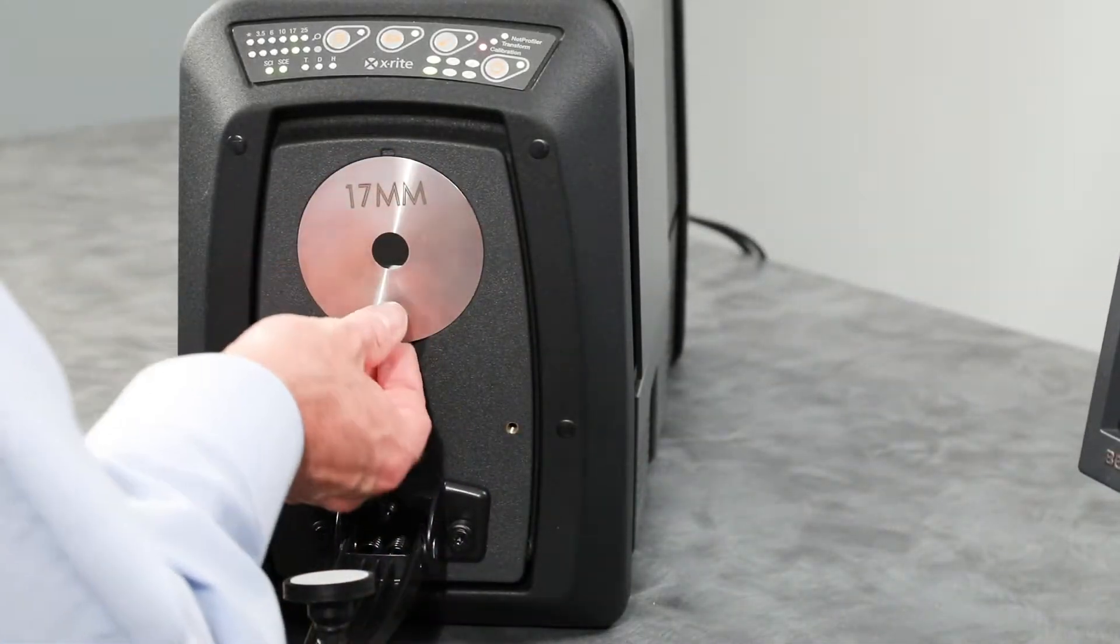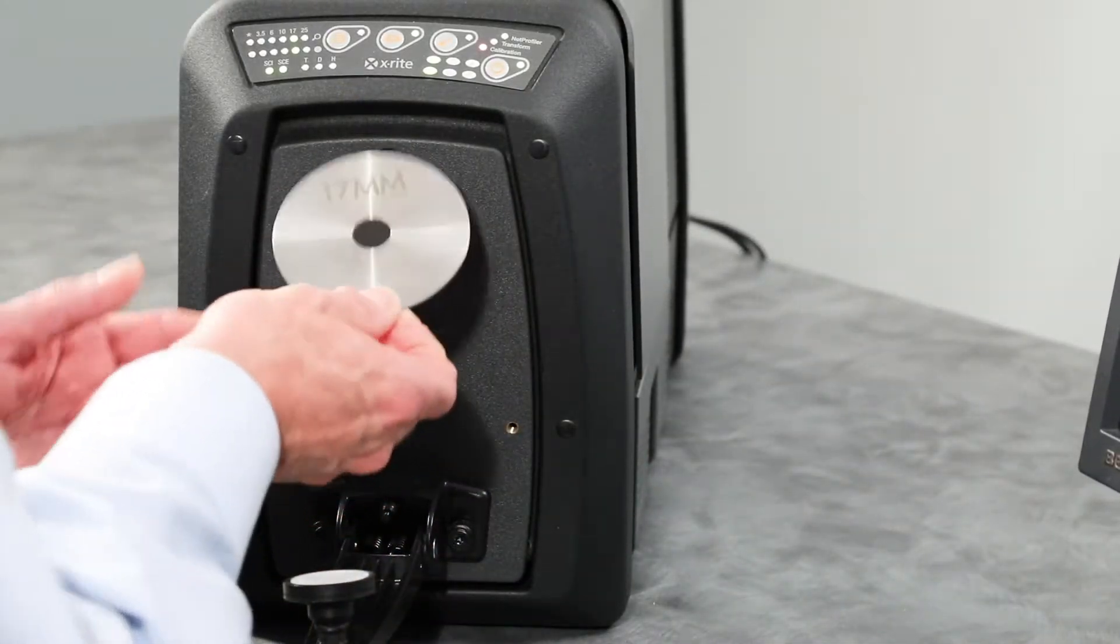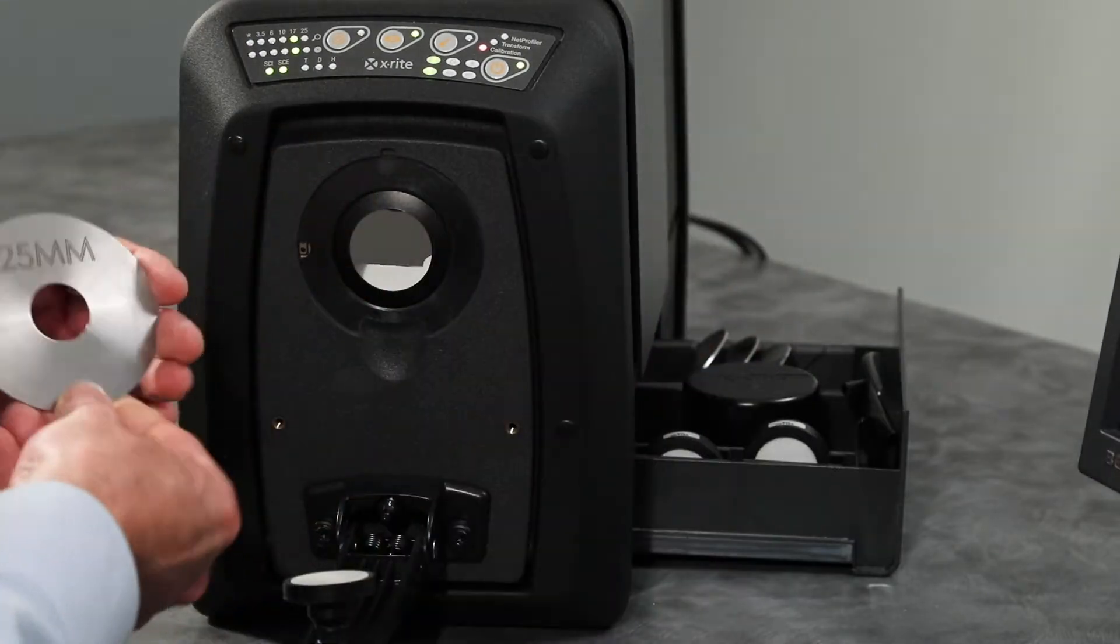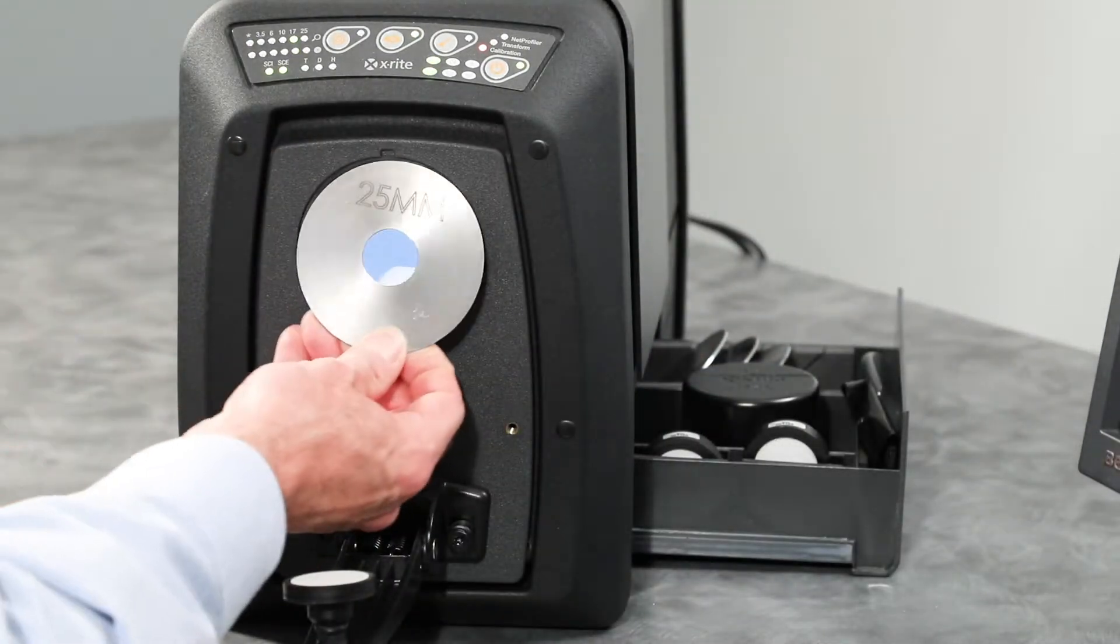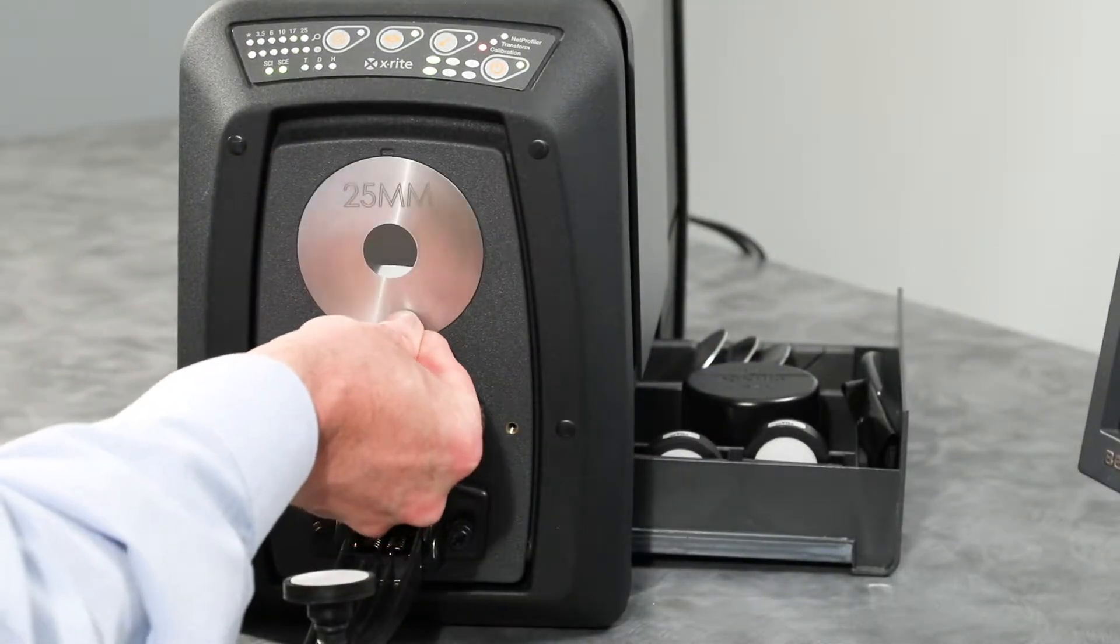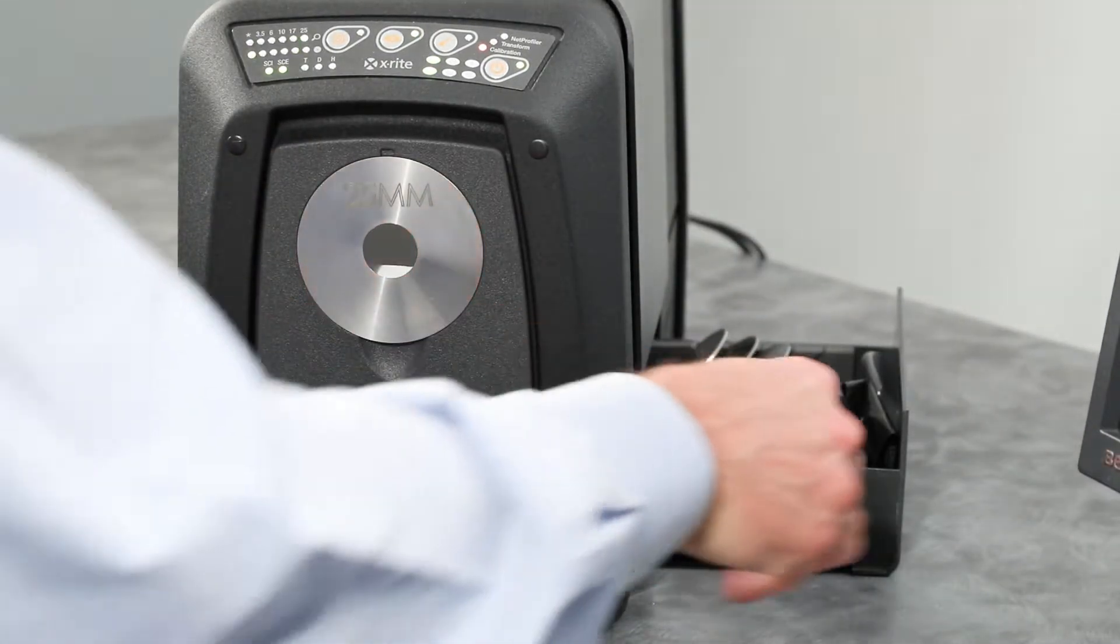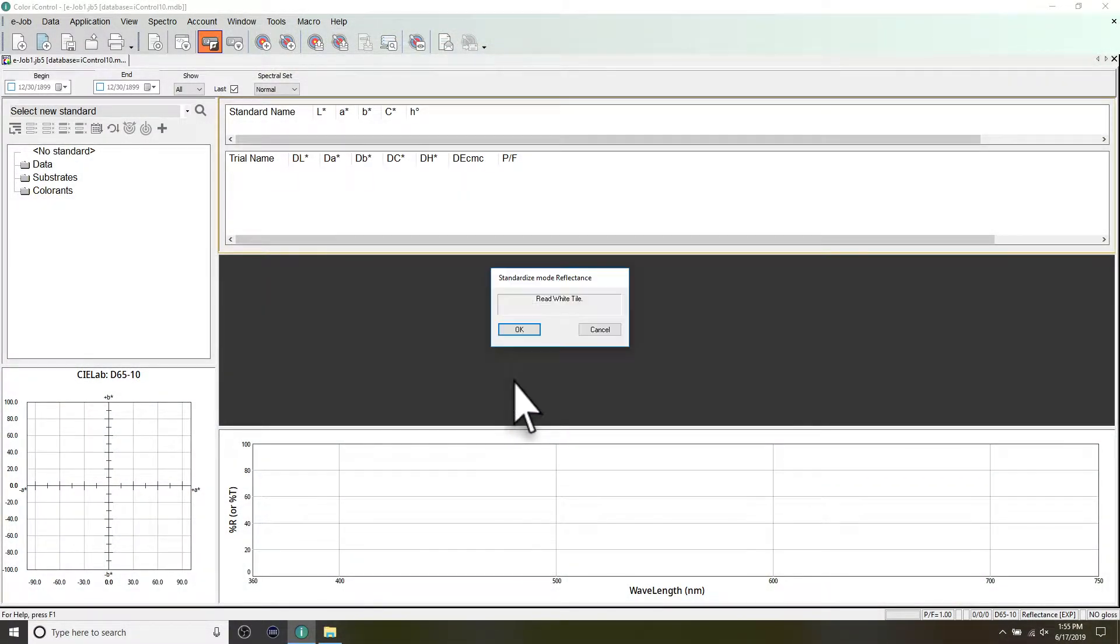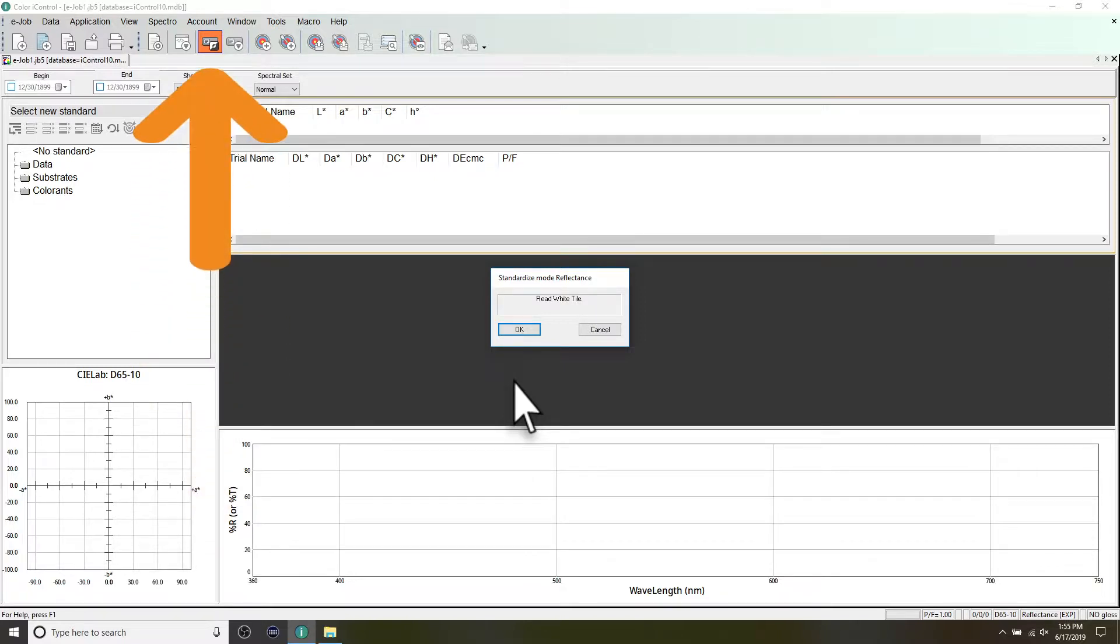To calibrate your instrument in reflectance measurement mode, first make sure the correct aperture plate is installed for your calibration mode. Select the mode you wish to calibrate and click the Calibrate button. A calibration can also be triggered by clicking this icon in your application toolbar.